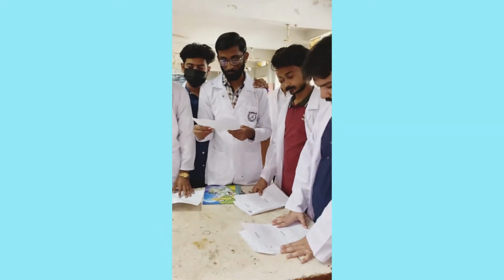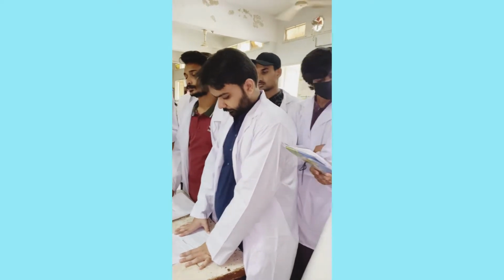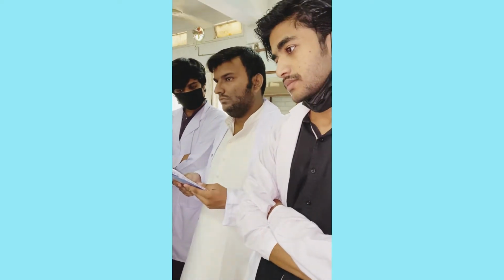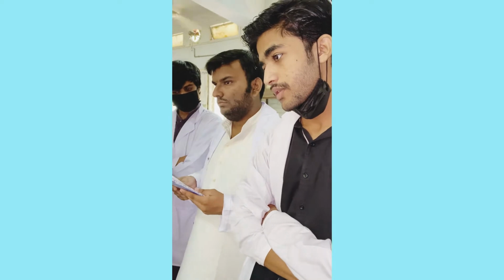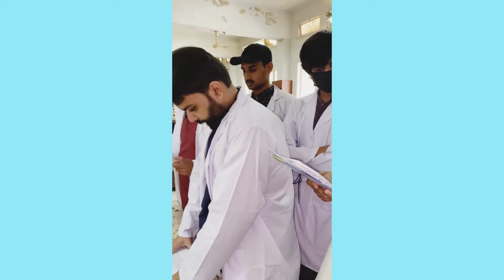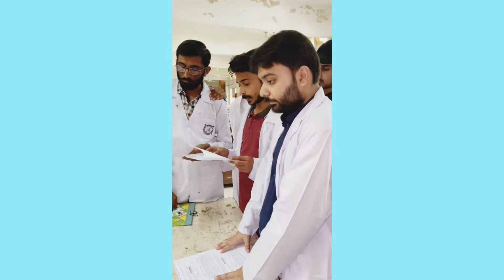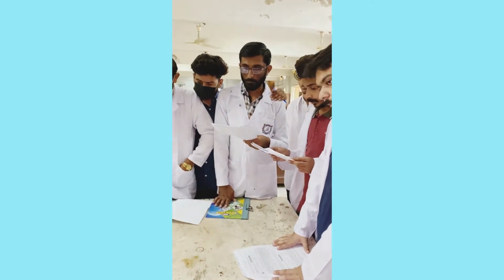Great. Okay. So now after writing the glassware, you are going to mention all the glassware you are using here and the chemicals. Now here, the first thing I can see is 0.5 gram of acetanilide. That means you will write down acetanilide, and you are going to write down the chemicals. Sulfuric acid I can see, then nitric acid, okay, and there are many other things. So you have to write everything here.